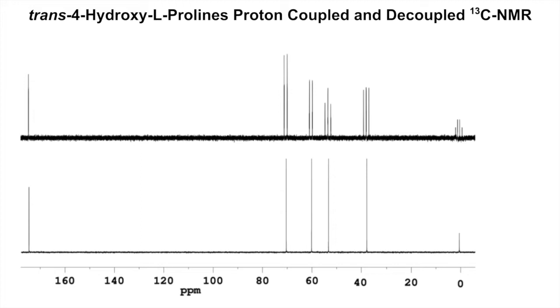Trans-4-Hydroxy-L-Proline, proton-coupled and decoupled carbon-13 NMRs. So yeah, that's a mouthful, but it's pretty cool, this stuff. The hydroxyproline is an amino acid, and it's an important one. It's a modified one. It has a hydroxyl group, an alcohol, added to it.